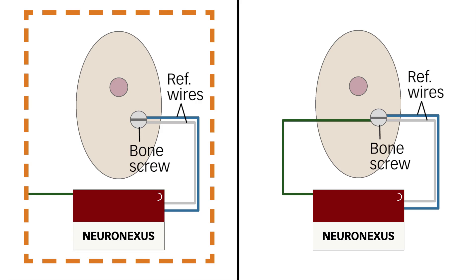Typically, the reference wire is tied to a bone screw. The ground wire can be connected to a Faraday cage around the O-Drive or tied together with the reference wire at the bone screw.